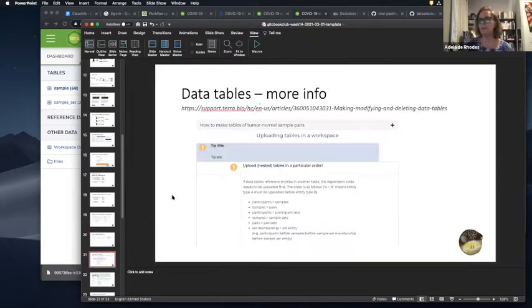Then it also does that for the workspace things. You can go into the workspace. Oh, and this is another screenshot I pulled in from the Terra help forum. I think this was written by Ali Hajan. Her stuff's very good. She's very good at documenting this stuff. And this just shows the complexity of bringing in a set of data sets that are linked from Mutect.